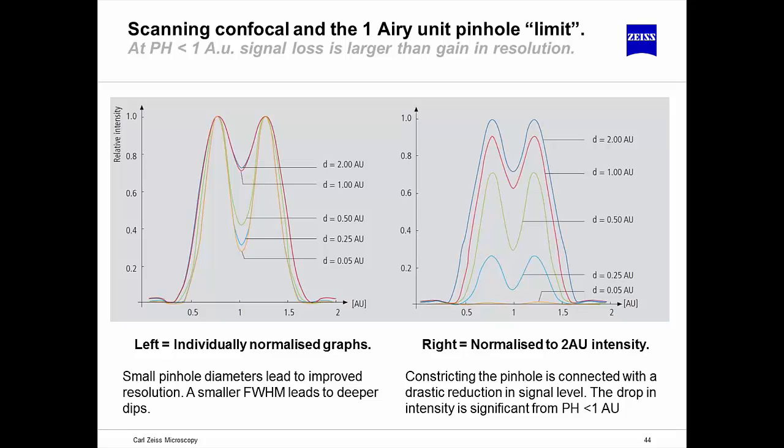These next graphs from the handbook show how this trade-off of sensitivity and resolution really works. The left-hand graph shows a cut-through of 2 point spread objects. Now, for these objects to be resolved, as you image across them, you need a dip between the two Gaussians. So this drop and dip is how you're able to resolve the two objects apart.